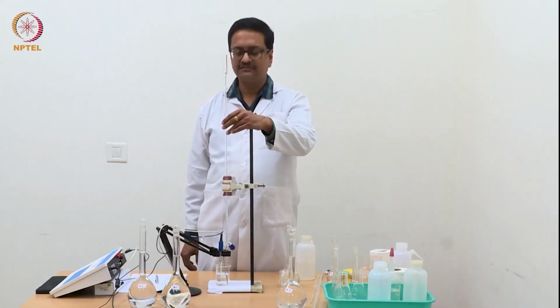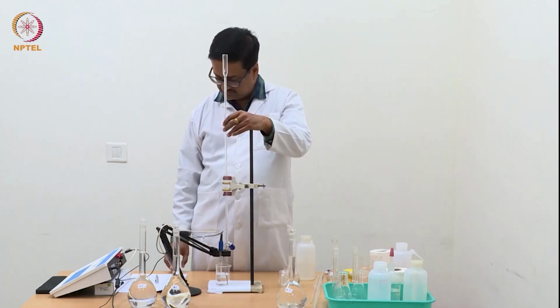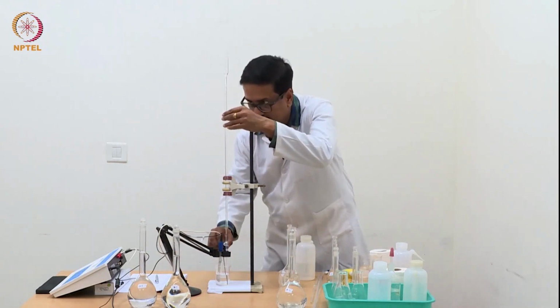So now I have reached 1.42 ml and the pH is 7.91. I will continue addition further.